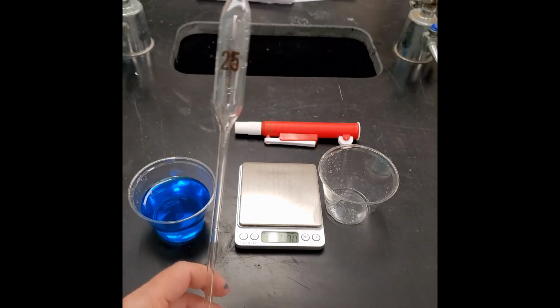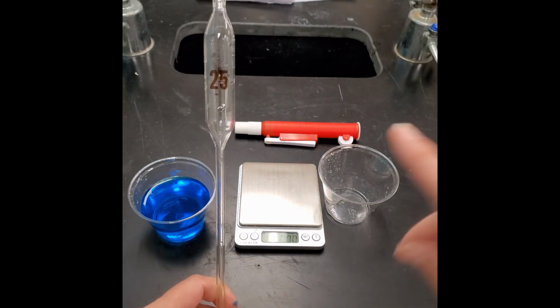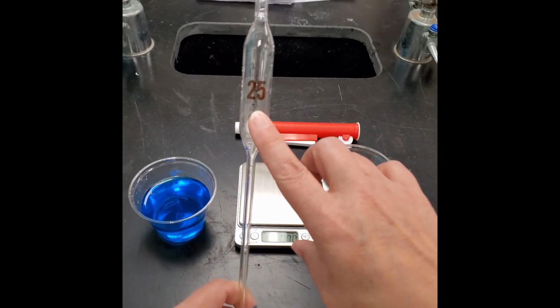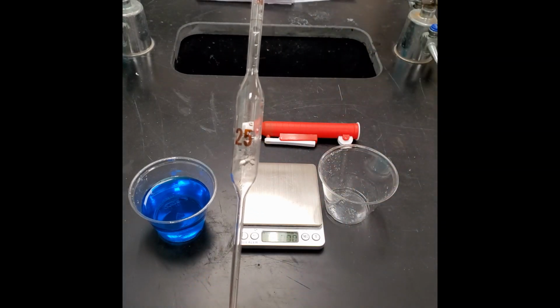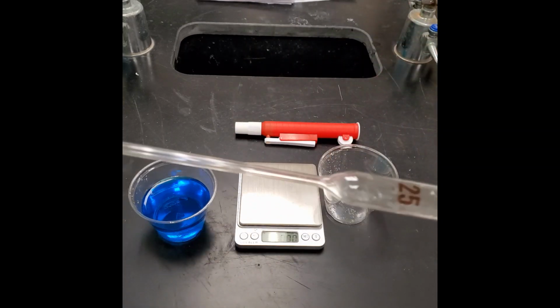This is designed to deliver a set amount of liquid, and this particular one, because it's a volumetric, can only ever deliver 25 milliliters. Now I'm going to show you how to use this, and so again, you should be taking notes because I'm not giving you written instructions. This is the instructions that I'm giving you right here verbally.